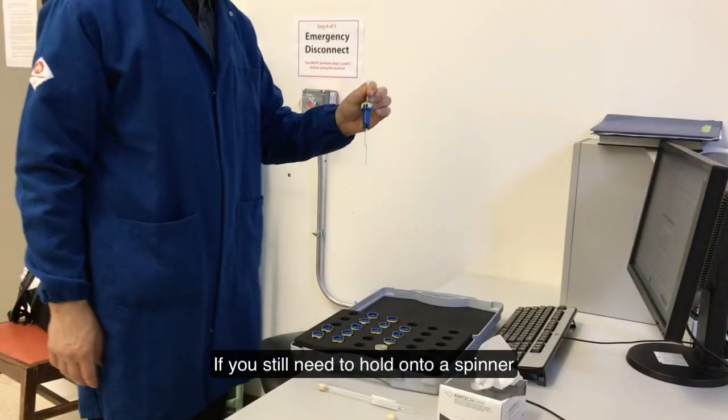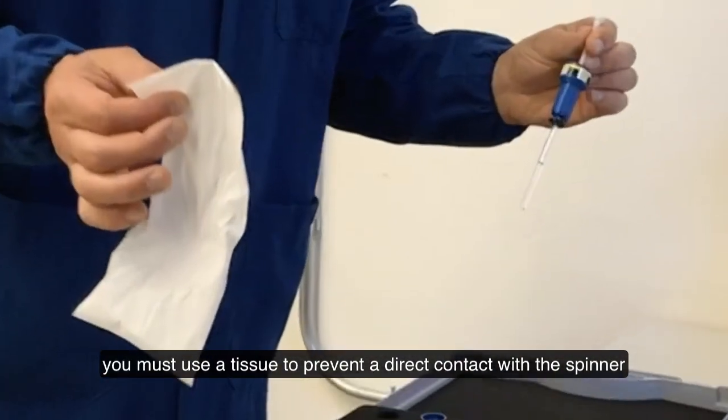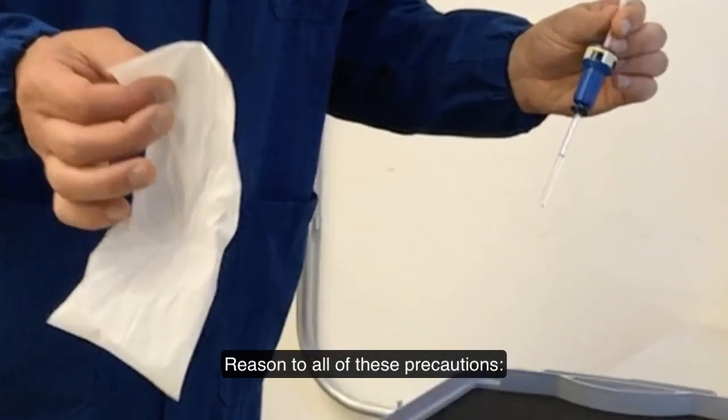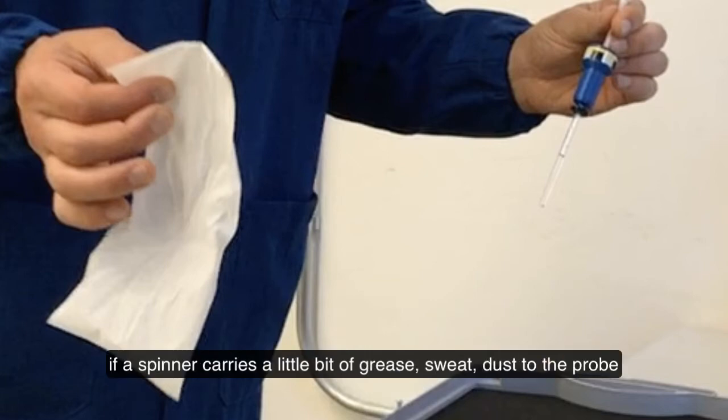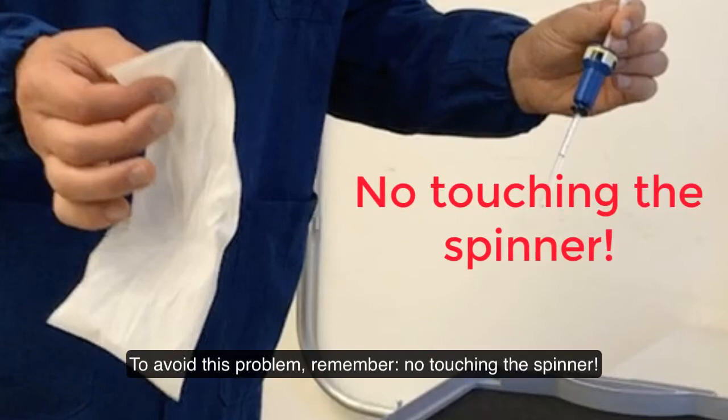If you still need to hold onto the spinner, you must use a tissue to prevent direct contact. The reason for these precautions: if a spinner carries a little bit of grease, sweat, or dust to the probe, it stays in the probe and at some point the instrument loses its ability to spin. To avoid this problem, remember — no touching the spinner.